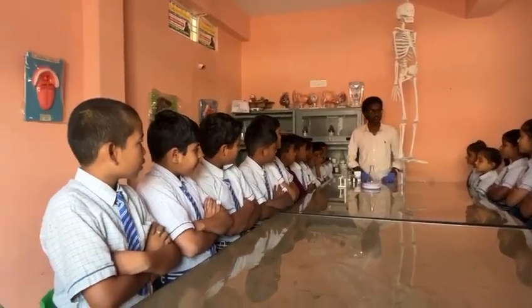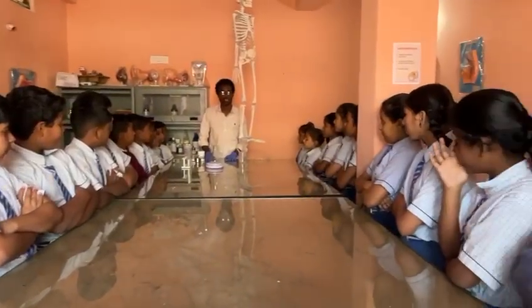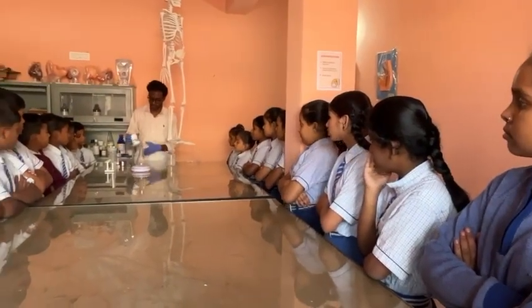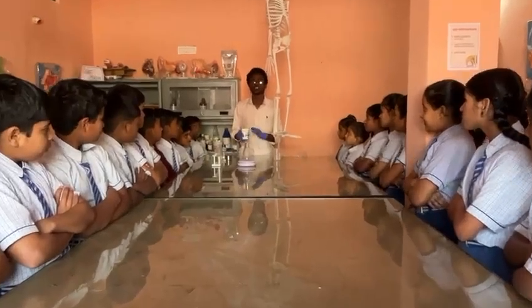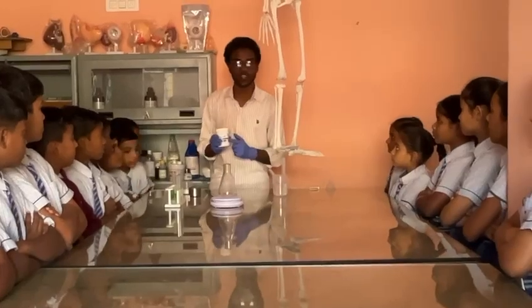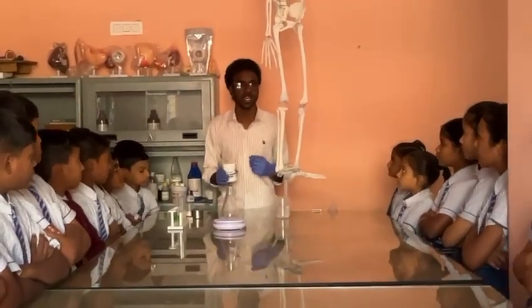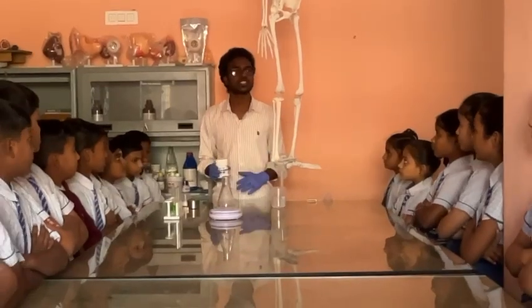Today we are going to do an activity to observe a chemical reaction. Chemical reaction with copper sulfate. The first activity is the reaction between copper sulfate and common salt, the salt which we eat, NaCl. It is also called sodium chloride.